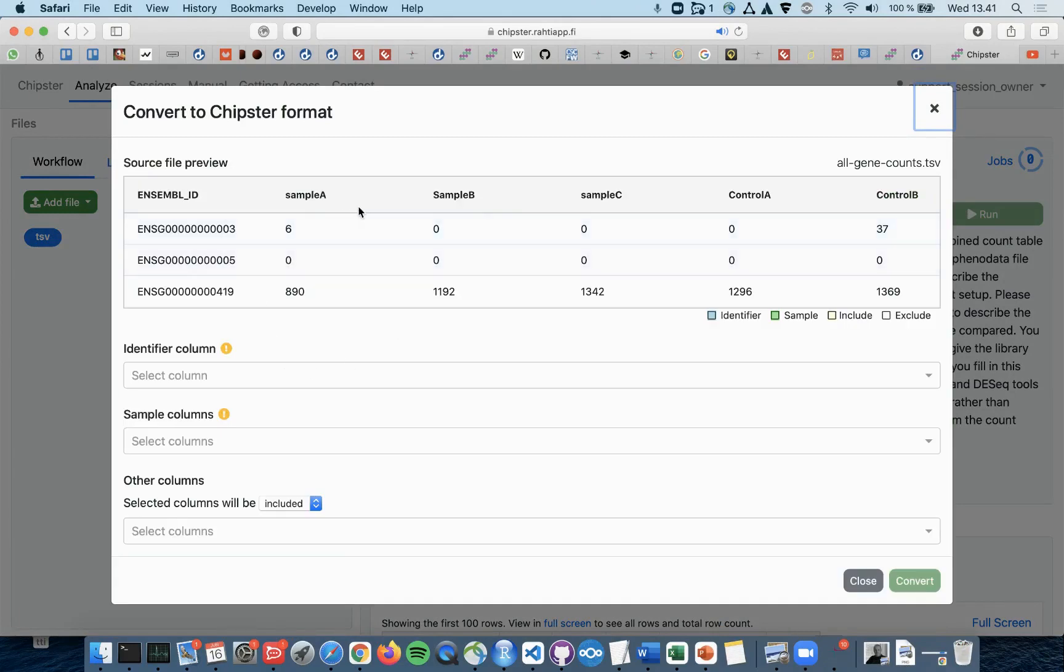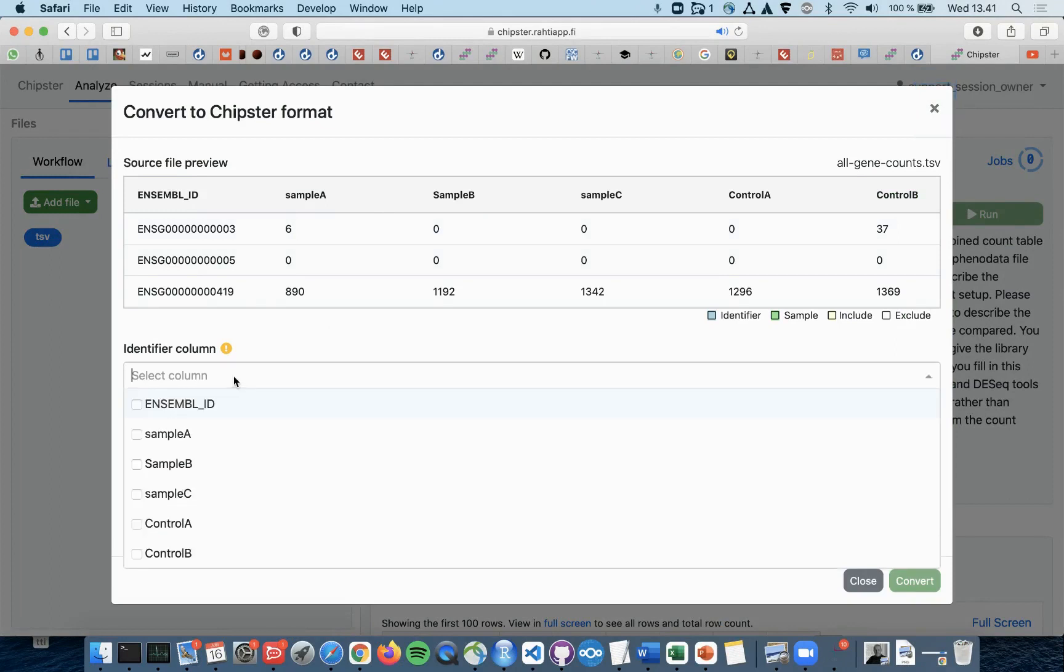This opens up a dialog page where you are asked to select the Identifier column. In this case, it would be the Ensemble IDs column.